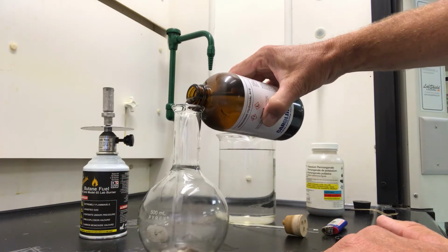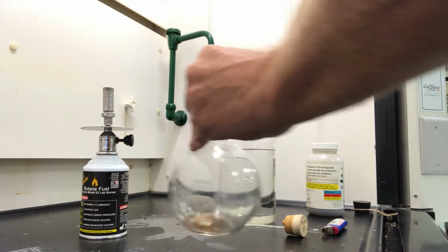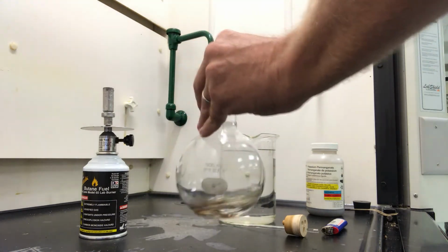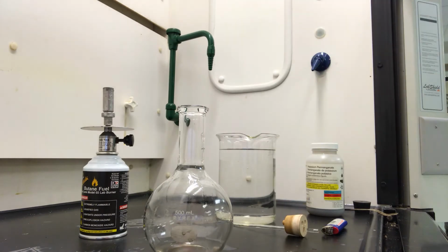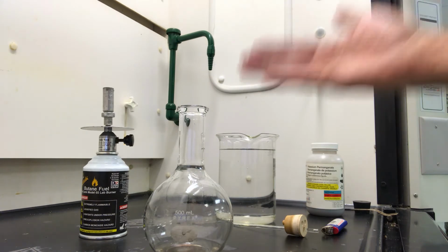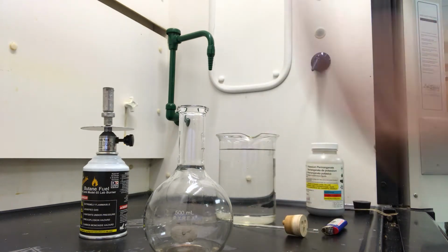And I'm just going to swirl it around. This gas is very volatile, which means it changes very easily into a gas. So just swirling it around a little bit makes the top of this flask fill up with ammonia gas. What was the gas that was in there originally? Just air, right. So now the ammonia gas is filling that area, pushing the air out. So we've still got air there.